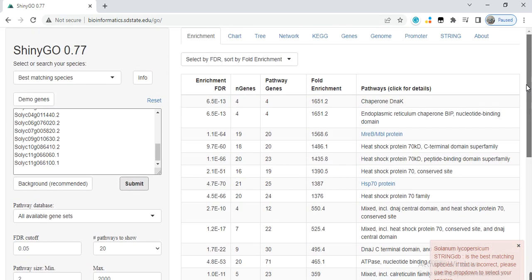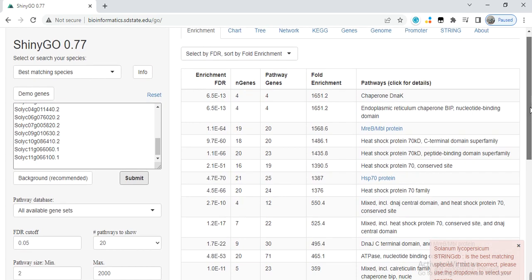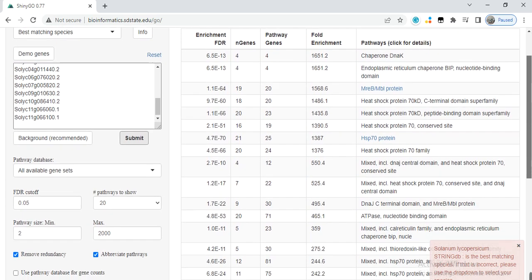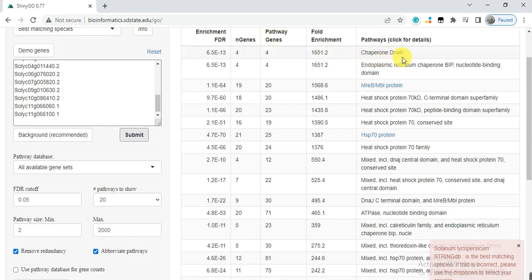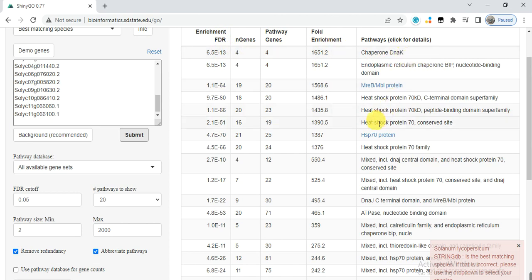Here is the information about those genes. Four genes are involved in chaperone DnaK and endoplasmic reticulum chaperone. Four genes show enrichment FDR, and these are the information of all those genes.